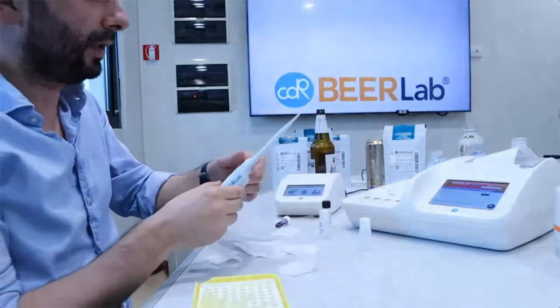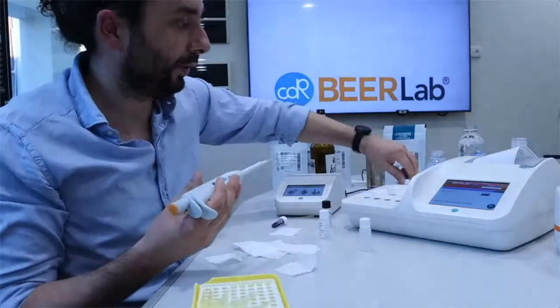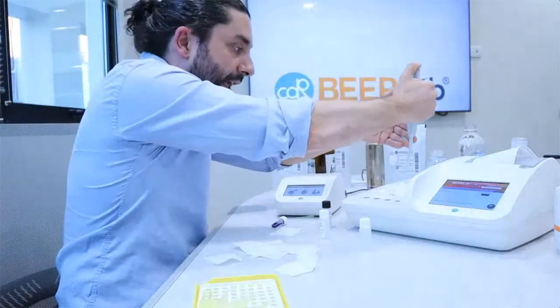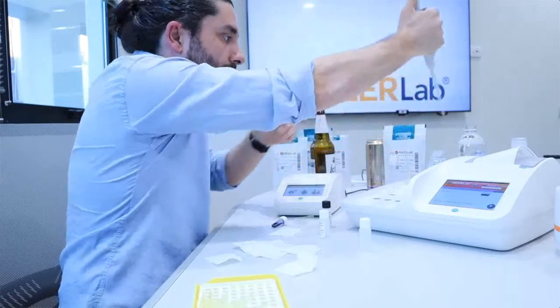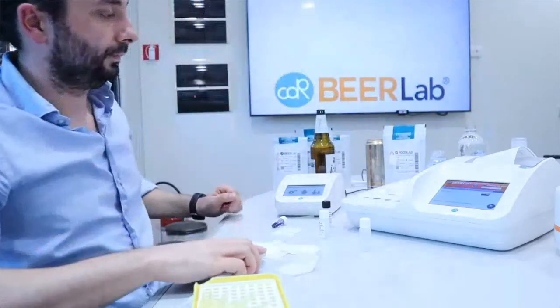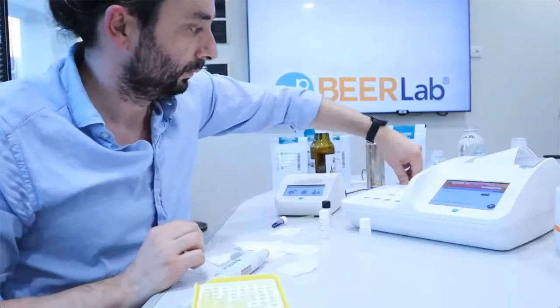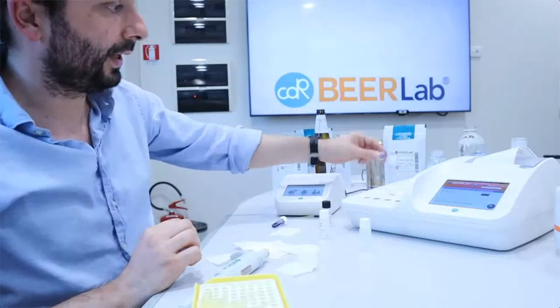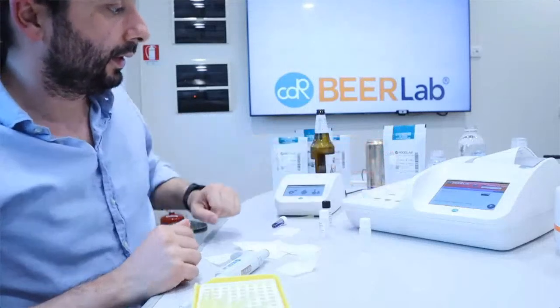Same story, wiping off the tip, and we open the cuvette, and we do the same. We put the tip into the liquid, and we press all the way down. We shake it in order to homogenize the cuvette, and we read it.